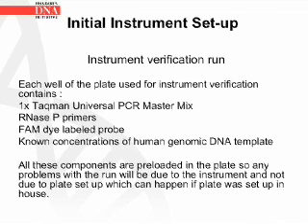Each well of the plate used for the instrument verification run contains the TaqMan Universal PCR Master Mix, RNase P primers, a FAM dye labeled probe, and known concentrations of human genomic DNA template. All these components are preloaded in the plate, so any problems with the run will be due to the instrument and not due to plate setup, which can happen if the plate was set up in-house.